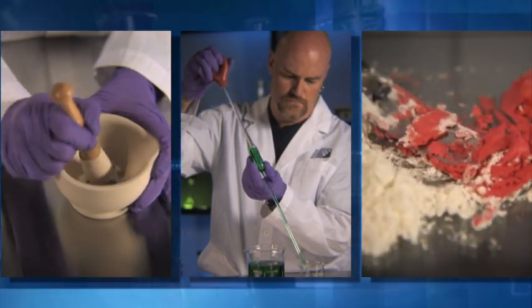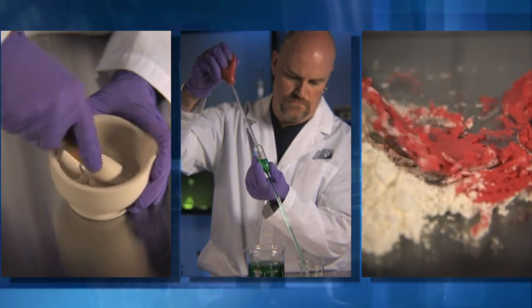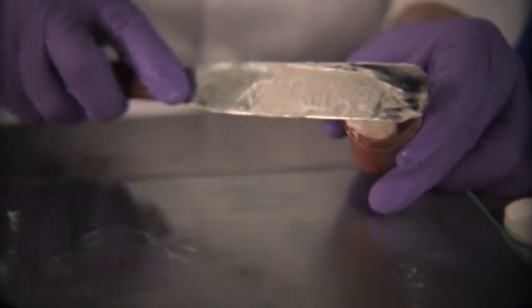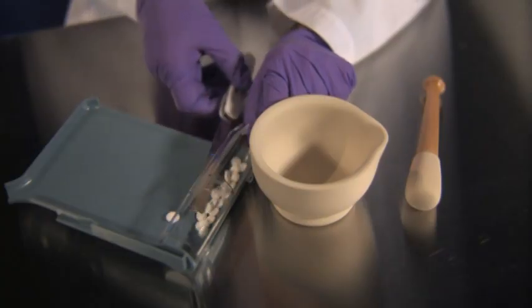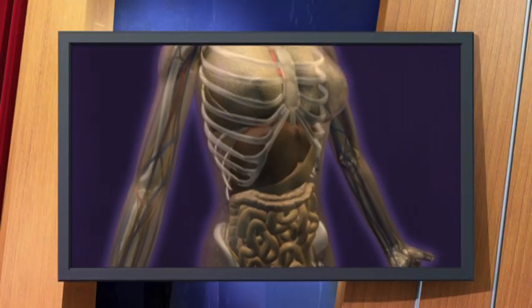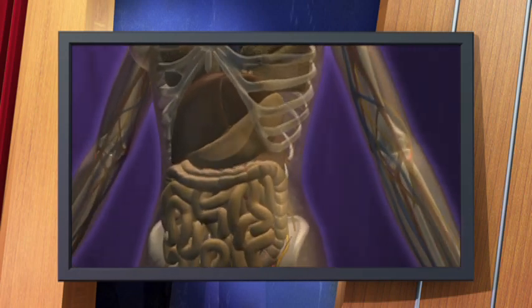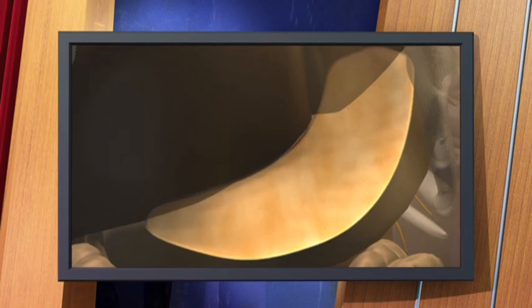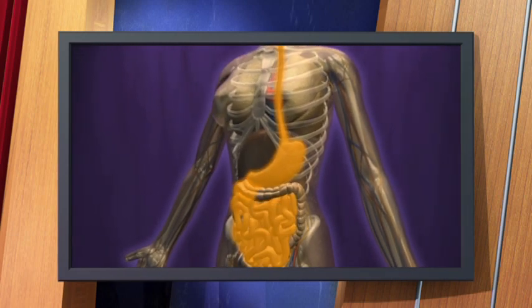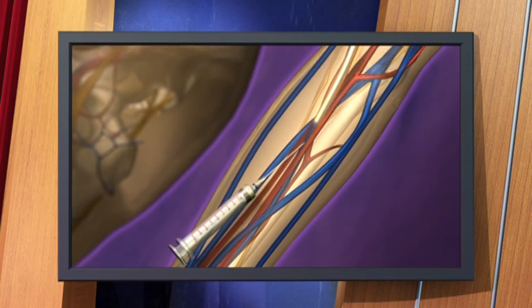Compounding means preparing or mixing medications in dosage forms, strengths, or combinations that are not commercially available. Preparations such as suppositories, creams, lotions, syrups, capsules, and sublingual tablets are considered non-sterile because of the routes of administration. They don't bypass the alimentary tract and are processed through the organs that form the body's natural filtering system, such as the stomach, liver, and GI tract.